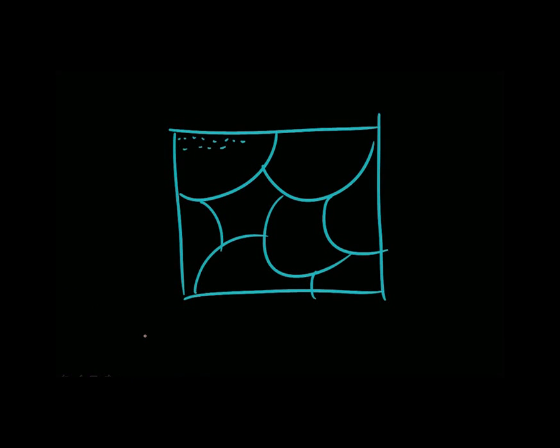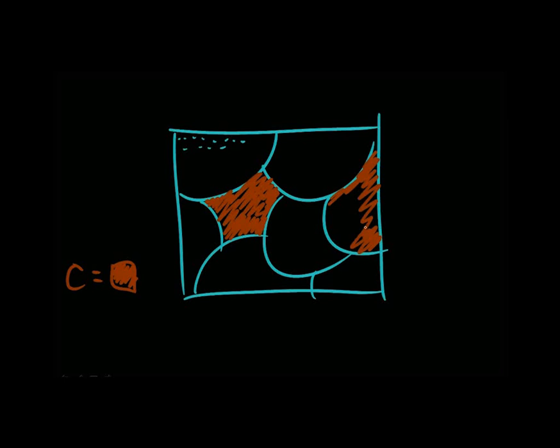If you tell it you want carbon painted this color orange, then everywhere you have elemental carbon present on your sample will appear orange. It'll probably look kind of pixelated because the odds of having no background noise are very small. But you'll end up with something like this.